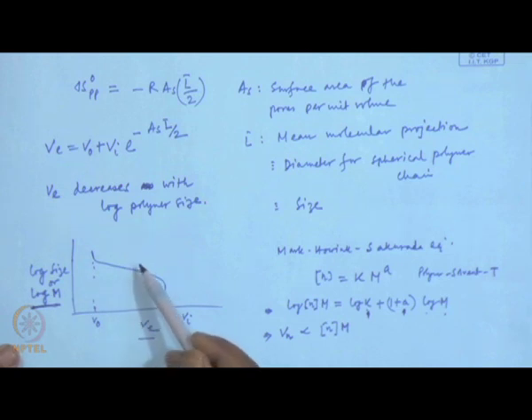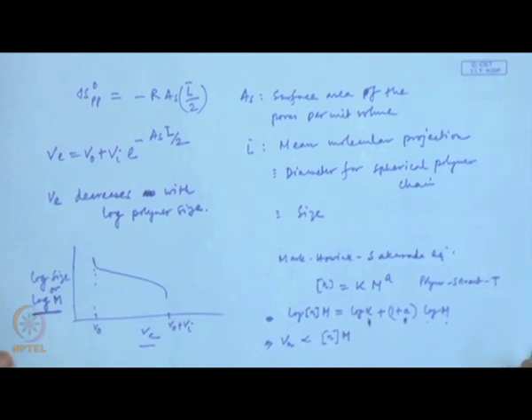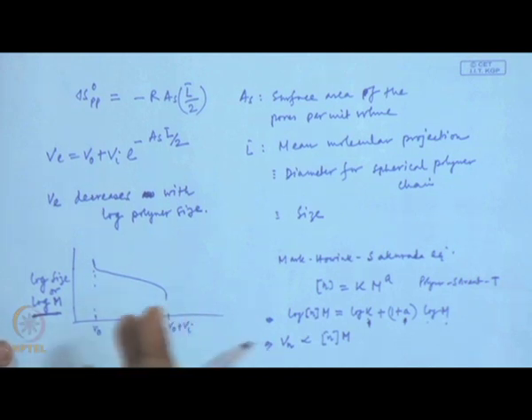But most of the time we use one set of calibration curve for a lot of other polymers, which gives us maybe 0 to 30% error in terms of molecular weight. The reason is that we cannot get a calibration curve made for all the polymers, because we cannot get narrow disperse polymer for all types of polymers, especially for condensation polymers like polycarbonate, polyesters, polyamides.